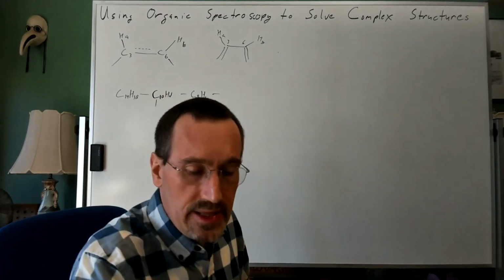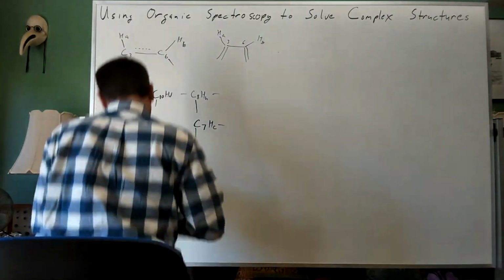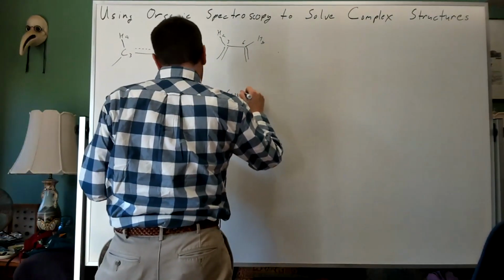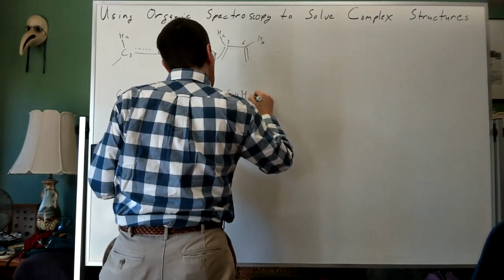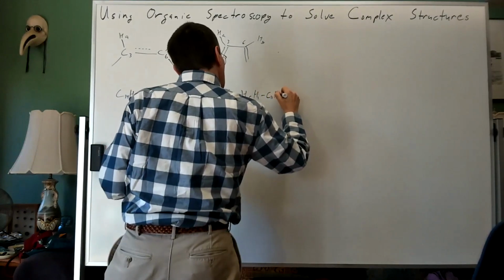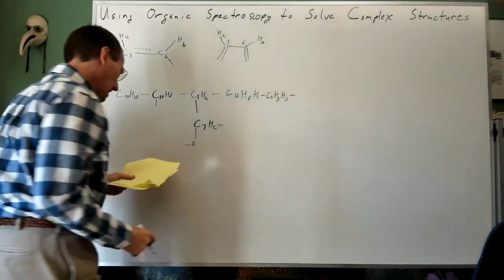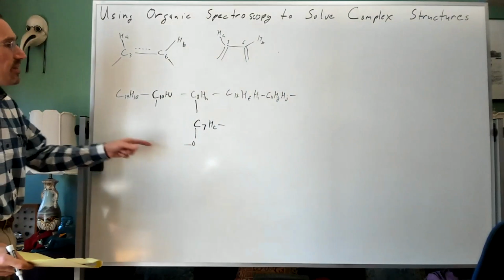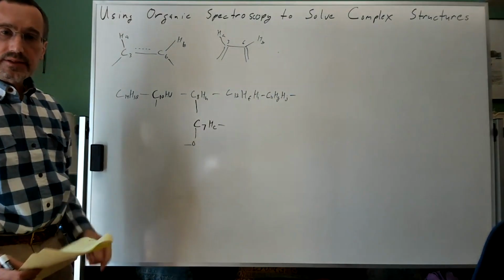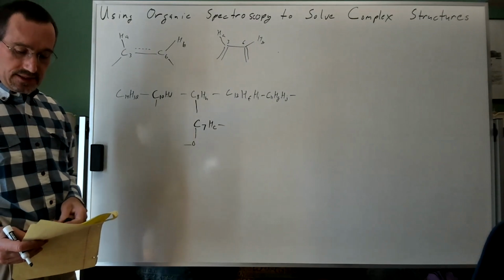The good news on that is there's a lot of redundancy built into this. So 8 is crossing with 13 in a couple of different ways. So we get C13, HF, HI, and that's linked to C11, HG, HJ. And again, I like to keep track of my valencies. So we have no open valencies here except one at the end. Questions or thoughts?